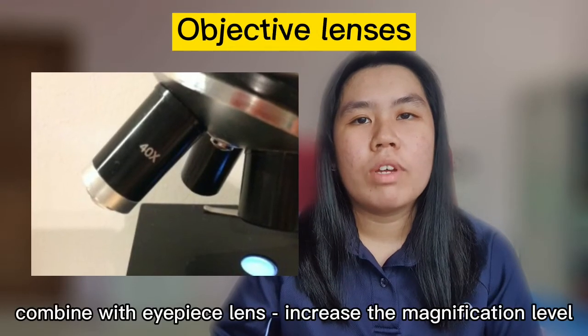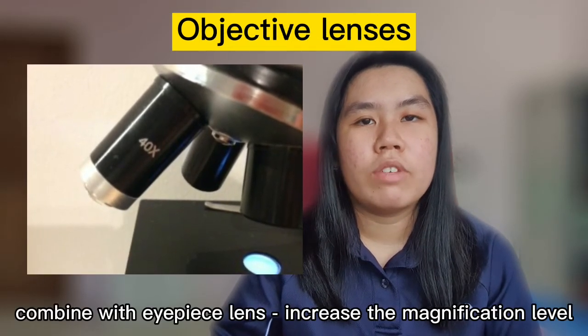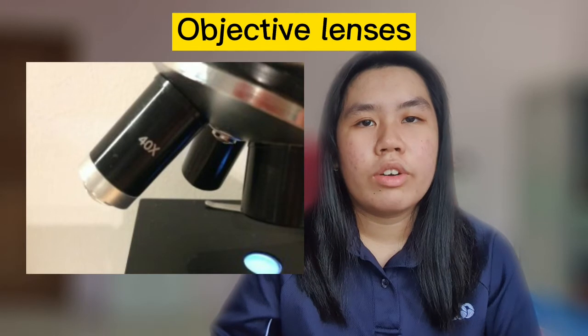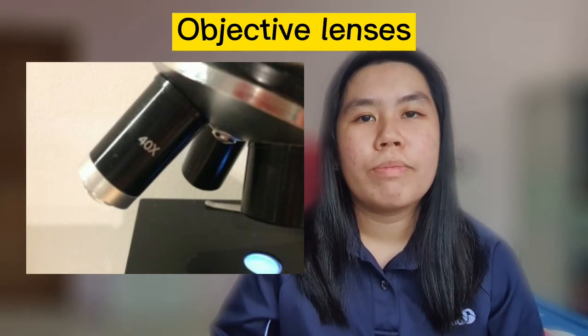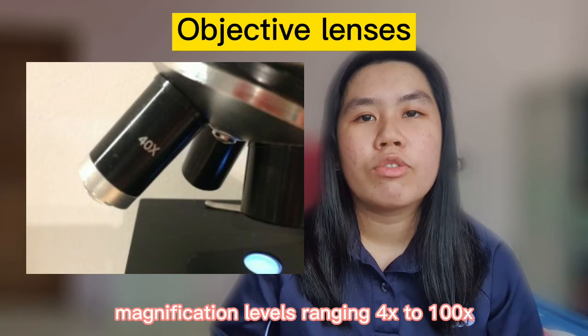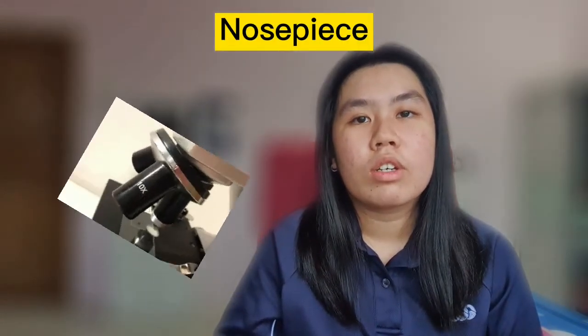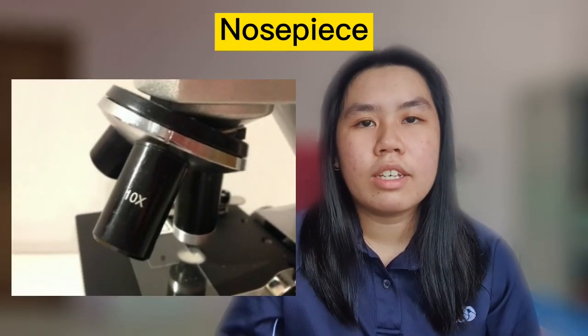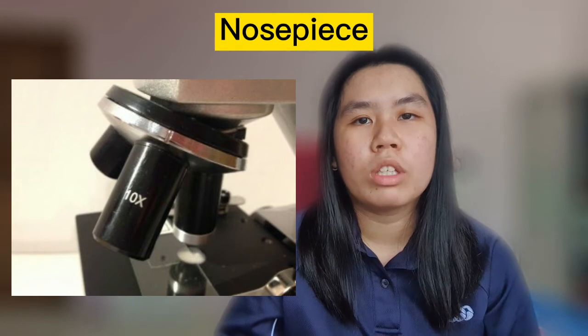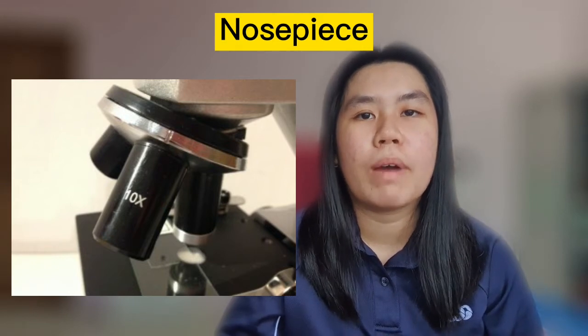Objective lenses. Objective lenses combine with the eyepiece lens to increase the magnification level. Microscopes generally feature 3 to 4 objective lenses, with magnification levels ranging 4 times to 100 times. The next one is nosepiece. Nosepiece contains the objective lenses. Microscope users can rotate this part to switch between objective lenses and increase the magnification power.